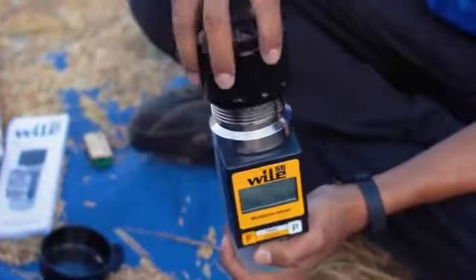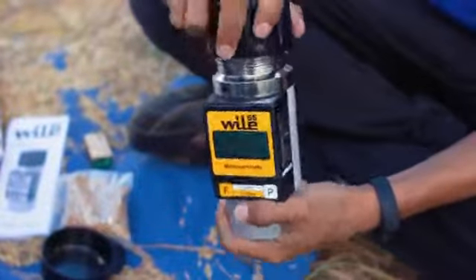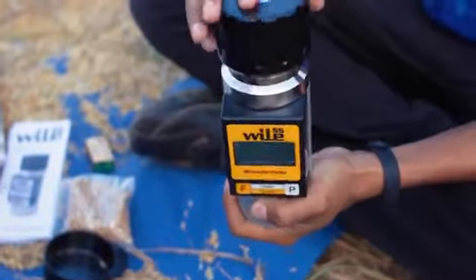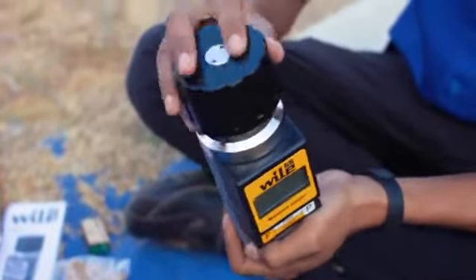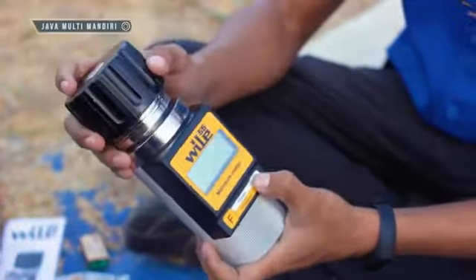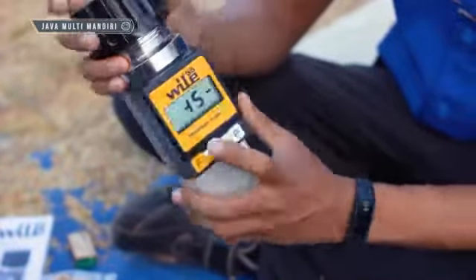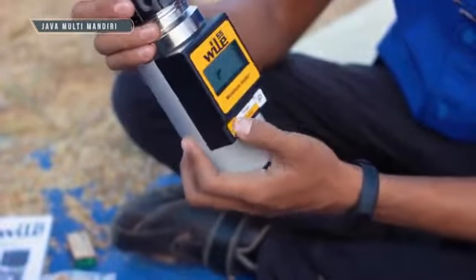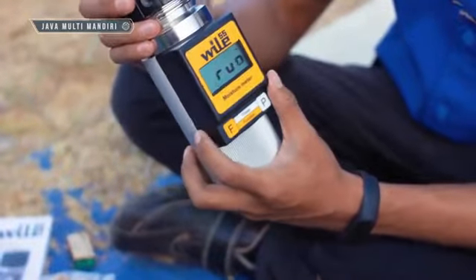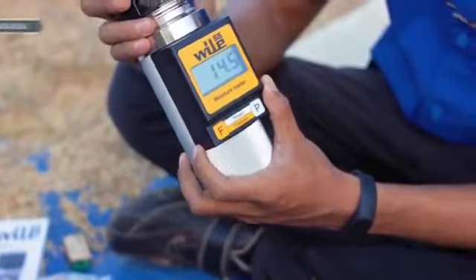Kemudian kita tutup. Lihat, titik tengah harus rata. Jika sudah rata, kemudian kita nyalakan alatnya. Lalu kita pilih kode nomor 13 untuk biji gedele. Ini sudah di ram. Untuk nilai kadar air pada biji gedele adalah 14,5.